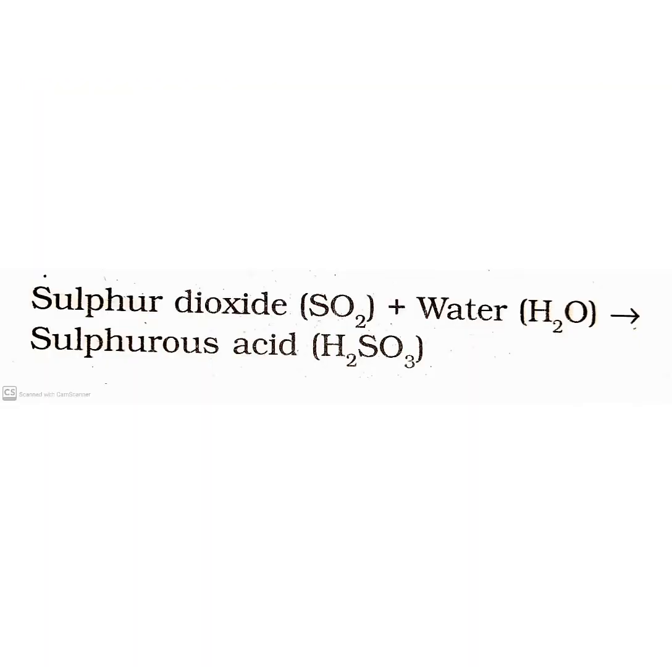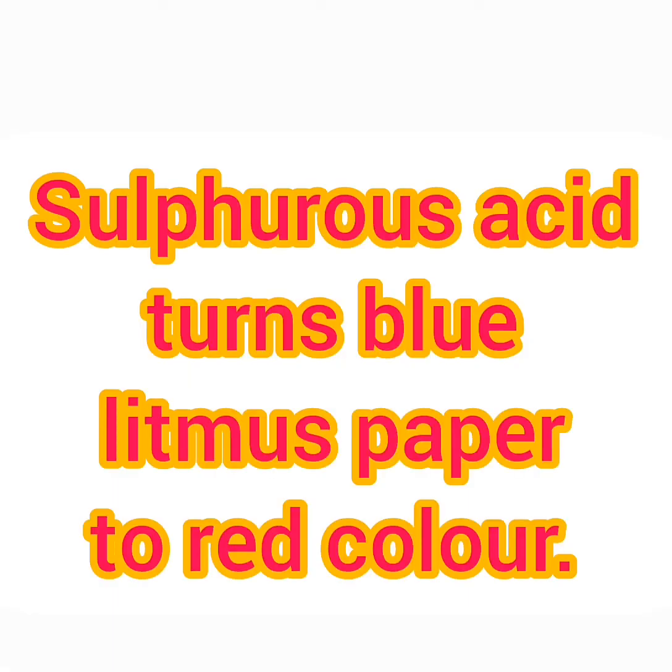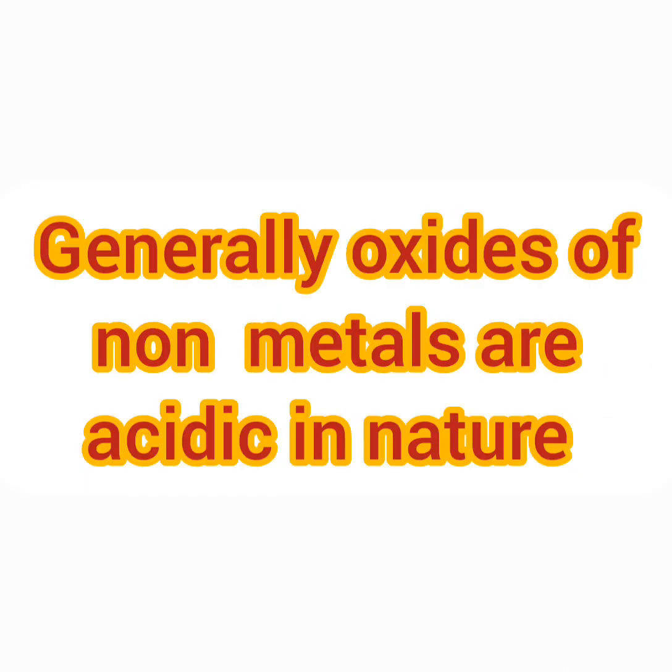When sulfur dioxide is dissolved in water, sulfurous acid is formed. It turns blue litmus paper to red color. That shows acidic nature. Generally, oxides of nonmetals are acidic in nature.